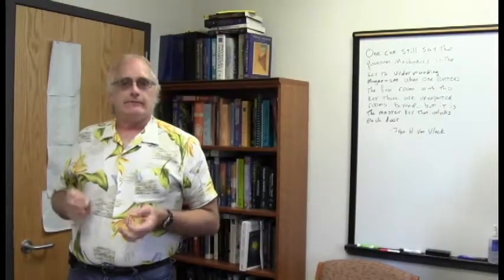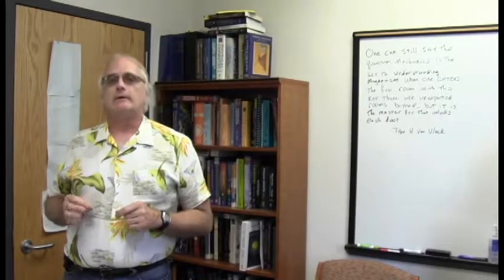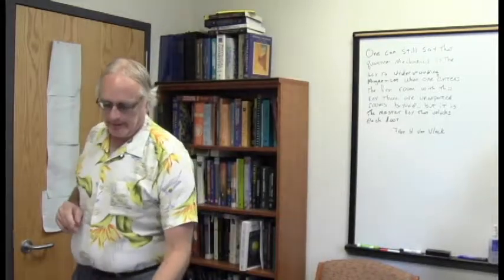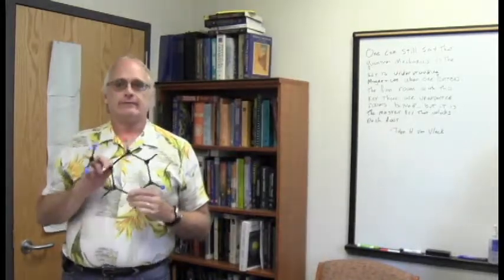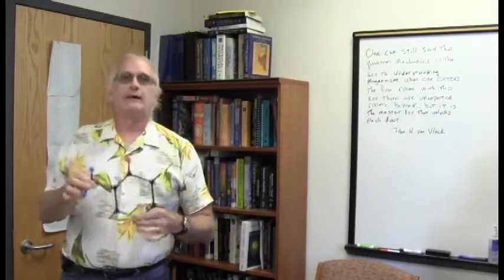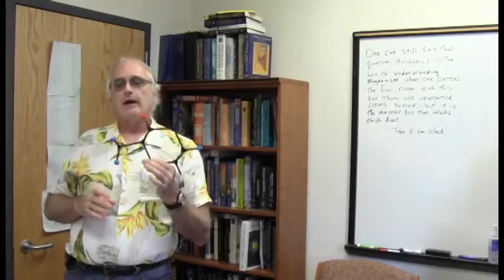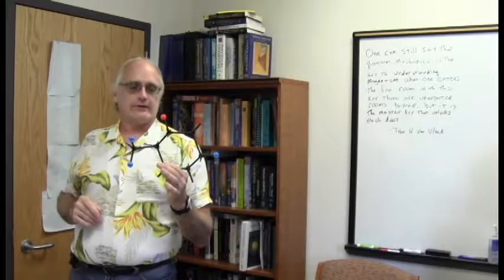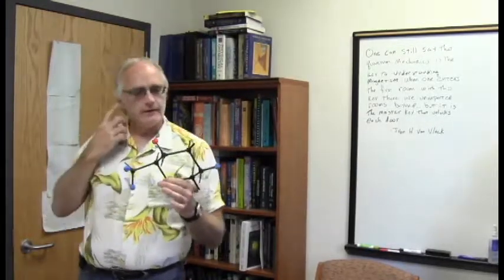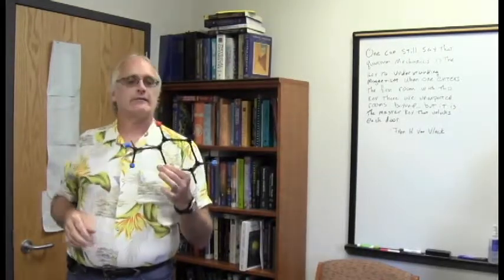Now that we've taken an inventory of some of the basic pieces using the carbon and the DEPT spectra, we're going to go after some of the easy characterizations in this molecule. And to help me with it, I'm just old-fashioned enough that I just love to have the plastic with me. Just give me that old-time plastic as far as I'm concerned. And so I've got the molecular model here. I'm using the blues to represent the methyl groups, the red for the oxygen, and then all the other hydrogen positions here with just the sticks coming out.